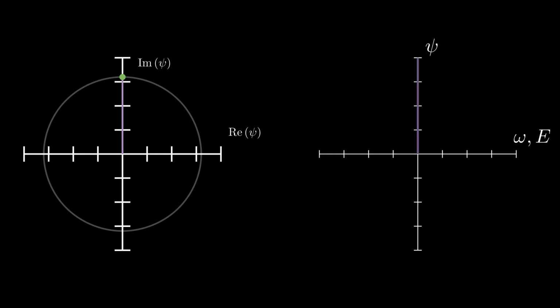Let's see this effect on the energy spectrum of the electron, together with its total complex amplitude. Before encountering the laser, all of the electron's wave function was concentrated in a single energy. Now, as we turn up the laser, it decomposes into a sum of many energies. As the energy filter will filter out all the energies which are not the original one, we will be left with an attenuated amplitude of the original unperturbed wave. Now, when the camera measures the field's intensity, there will be no bright background to the object, and the image will contain only the signal itself.